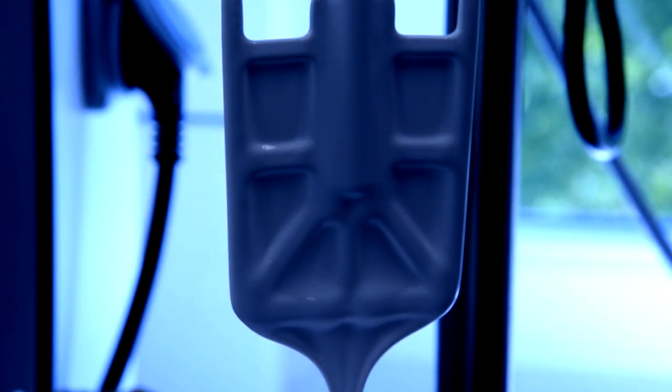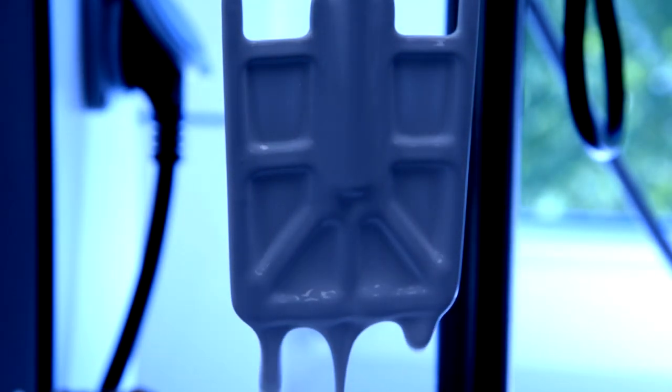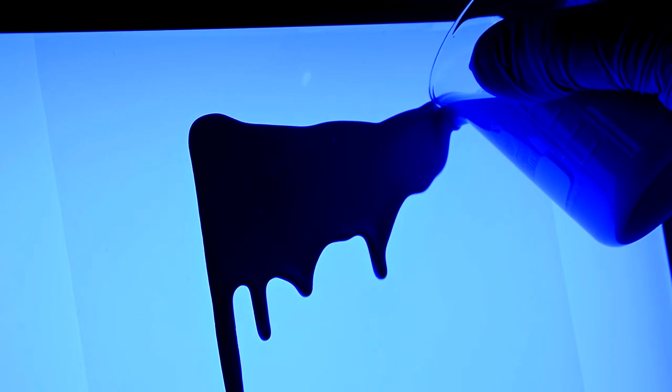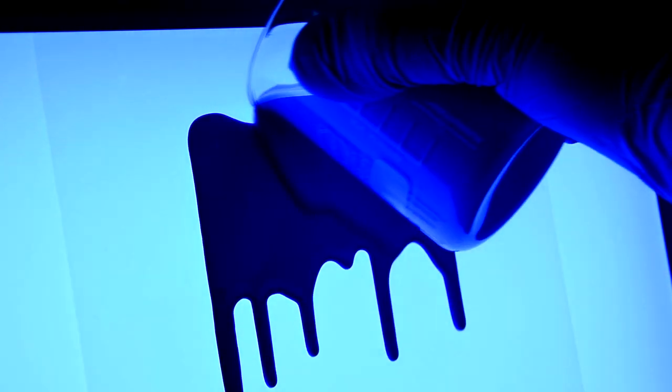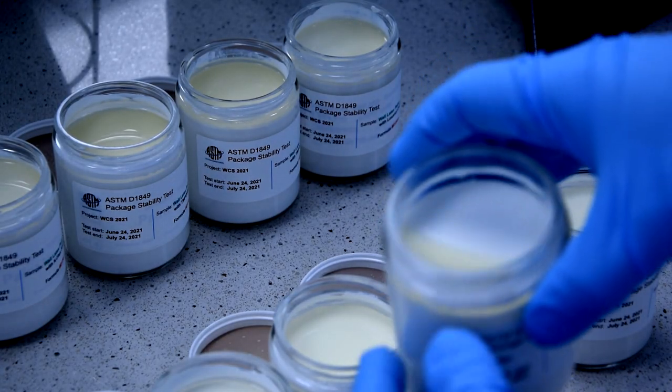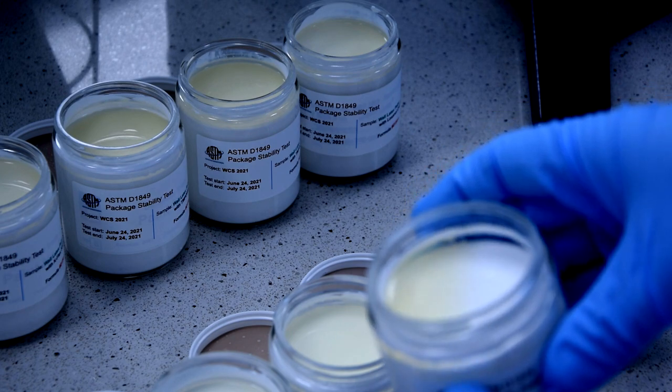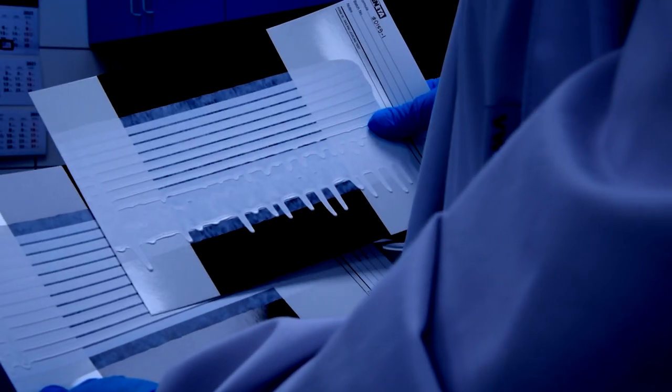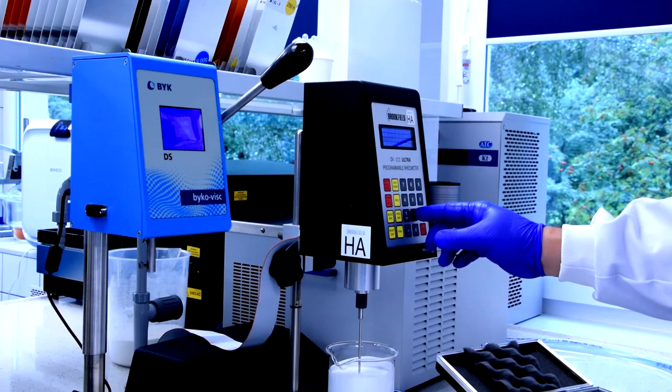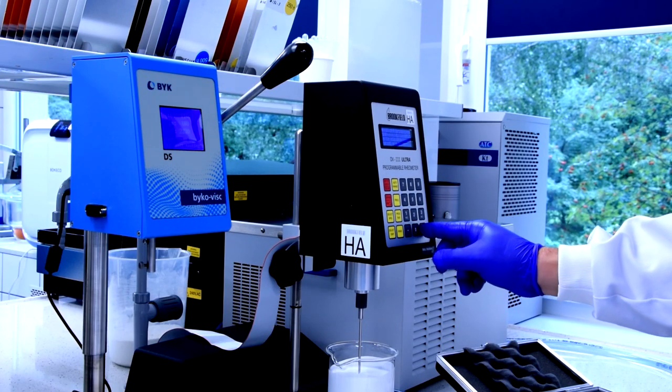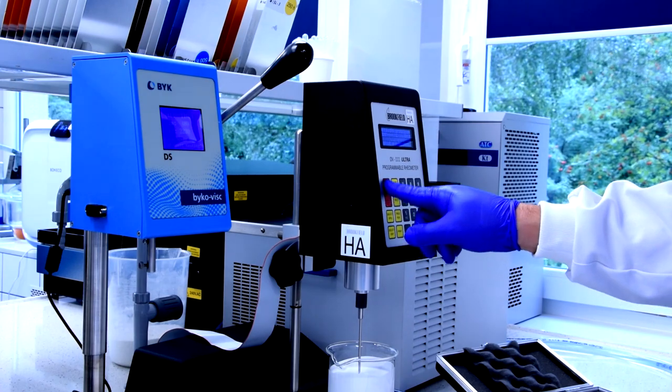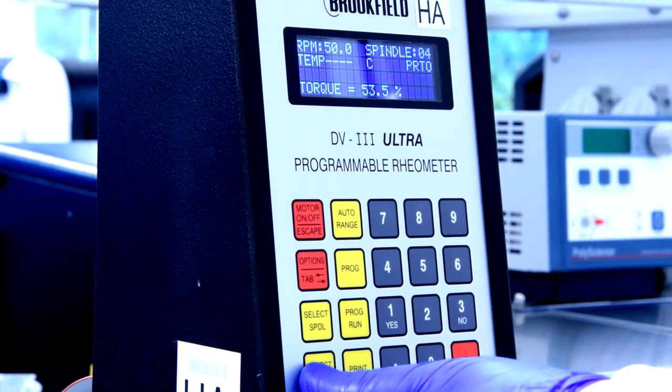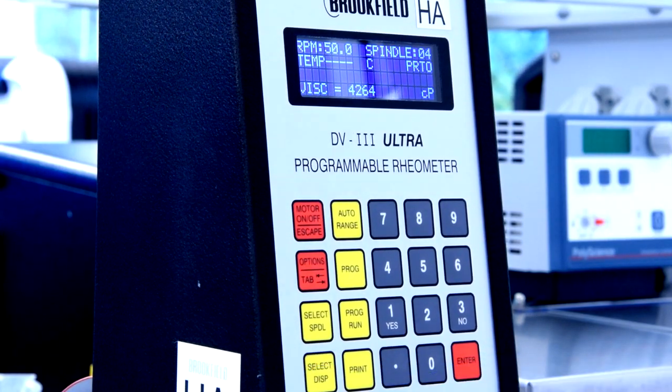In the Spectrochem lab, the prepared formulations and paint samples for thickeners examinations are subjected to various tests, ranging from storage stability through the determination of anti-sag index, leveling to the measurement of viscosity changes at low shear forces using the Brookfield viscometer in various viscosity ranges and mid shear forces with Stormer viscometer.